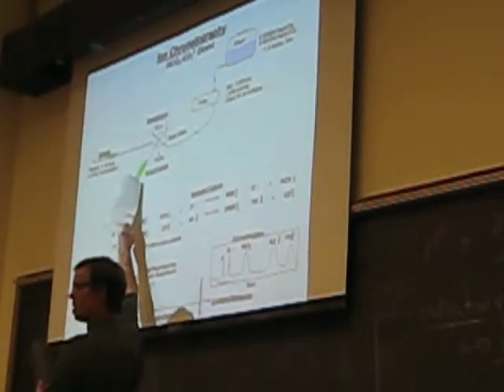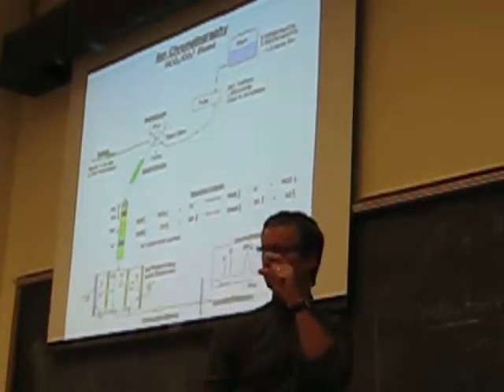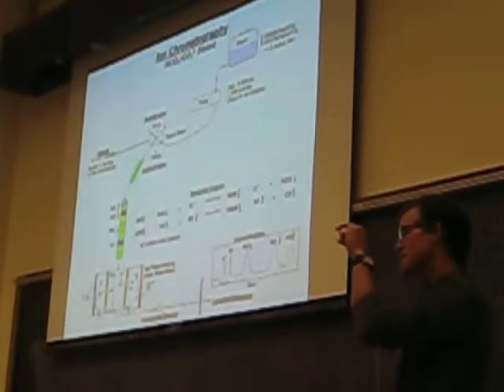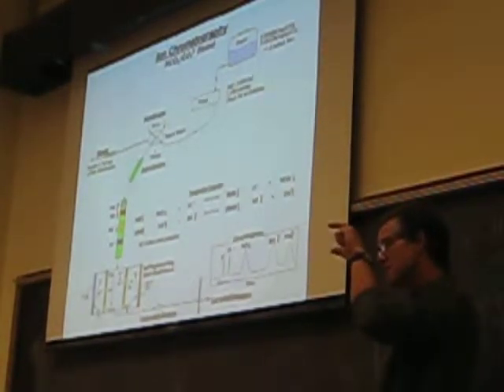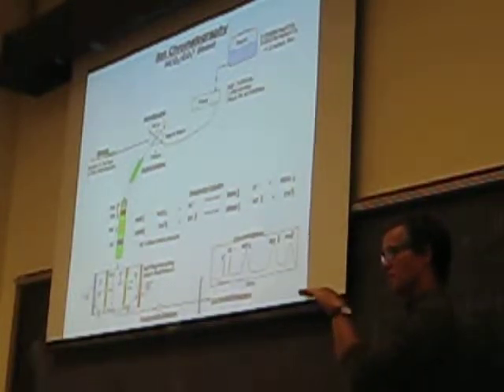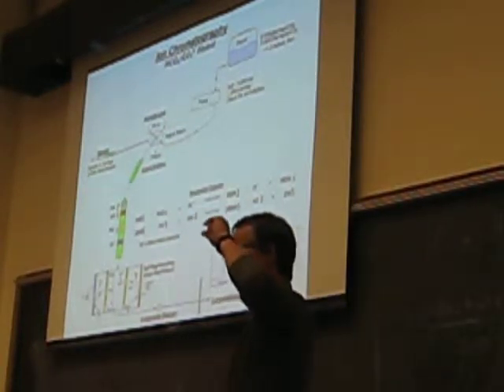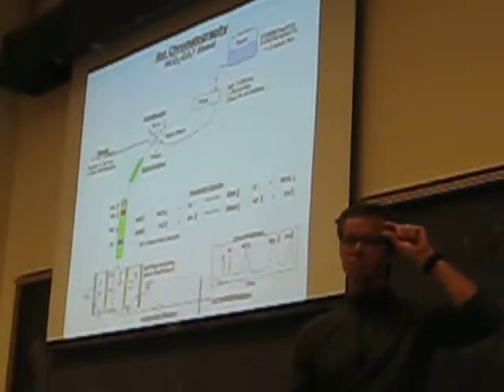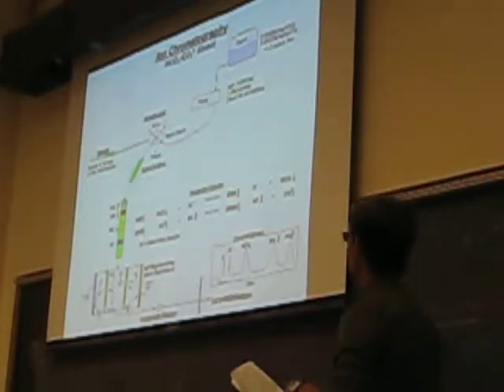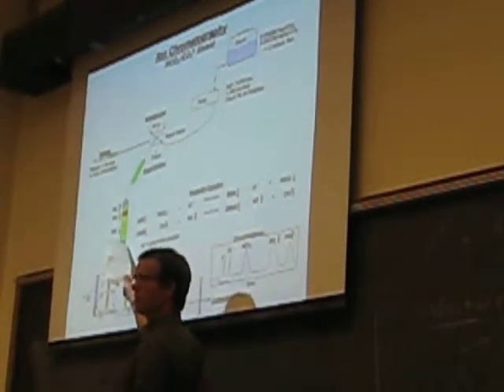And then it goes to the guard column. And the guard column, we talked about, is the same material as the analytical column that you're using, but it's much smaller. The idea is it's not necessarily supposed to facilitate separations, but it's supposed to help protect the analytical column from the inadvertent injection of samples that have high concentrations of particulates or things that may clog the analytical column. And the cost of the guard columns is relatively inexpensive compared to the cost of the analytical column.